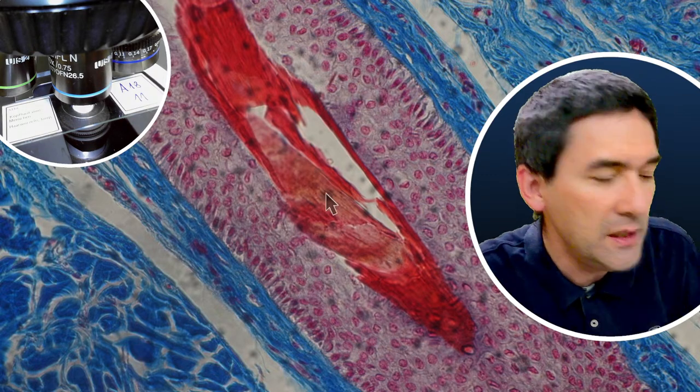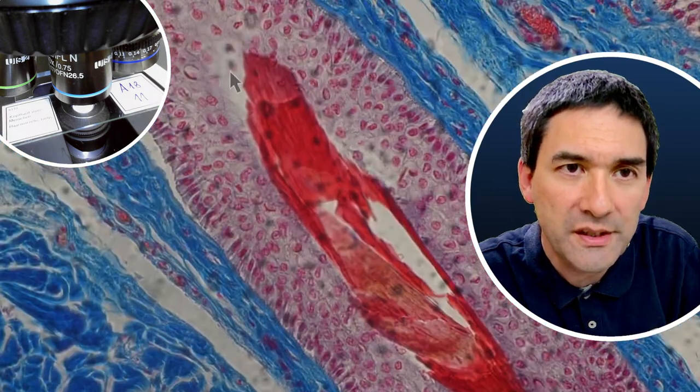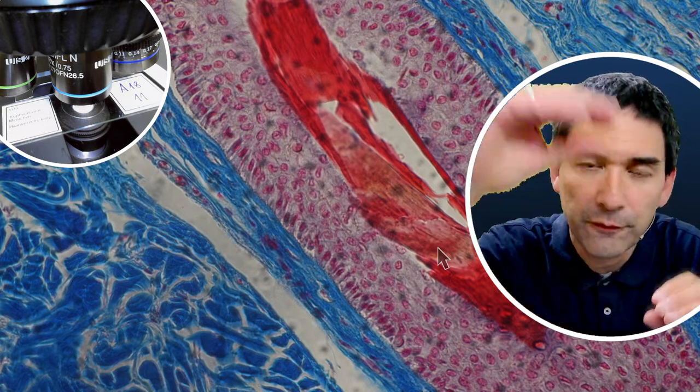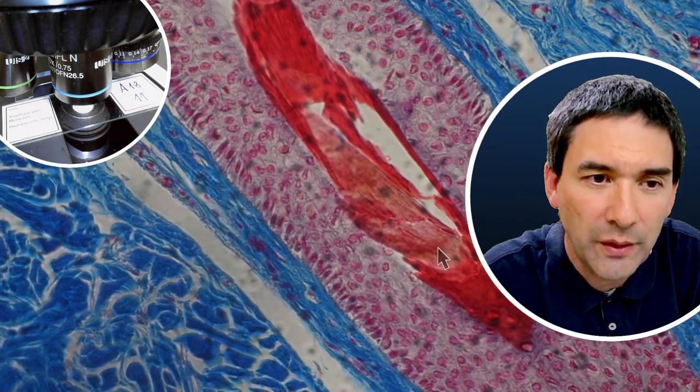And the reason why the hair looks like it already stops here is because it's been cut across, okay? So it continues at a different height, and for this reason we don't see that. So that's basically one thing.